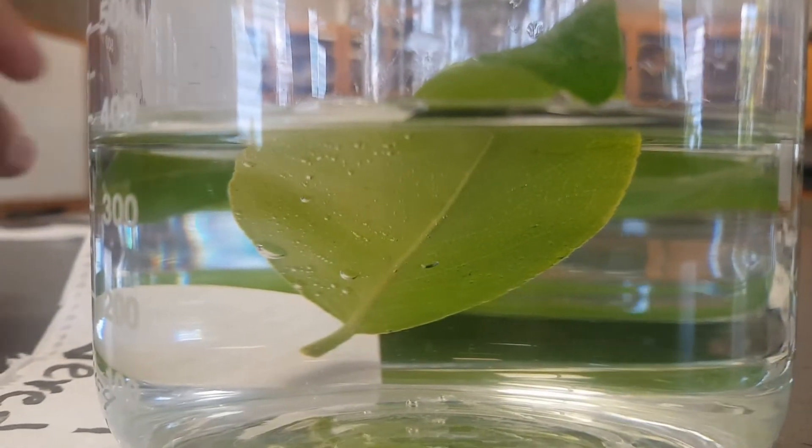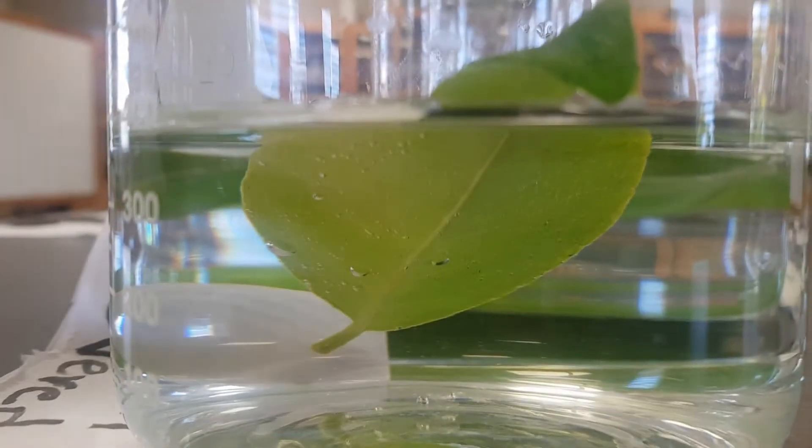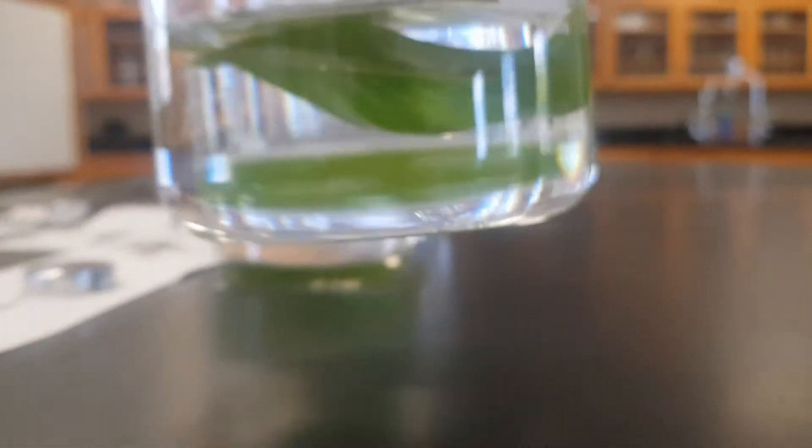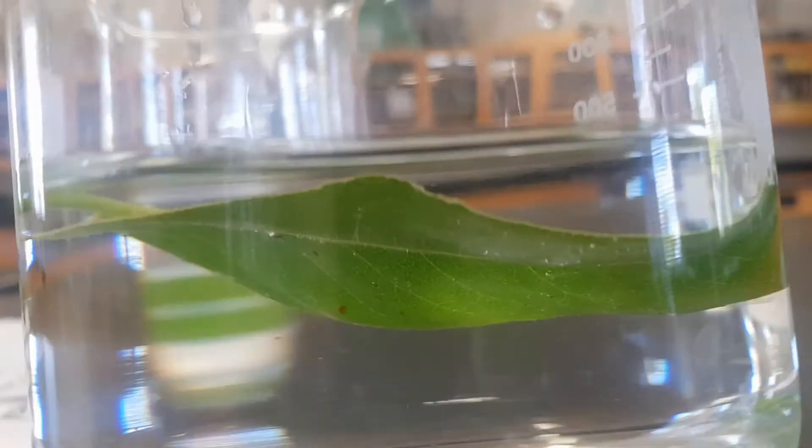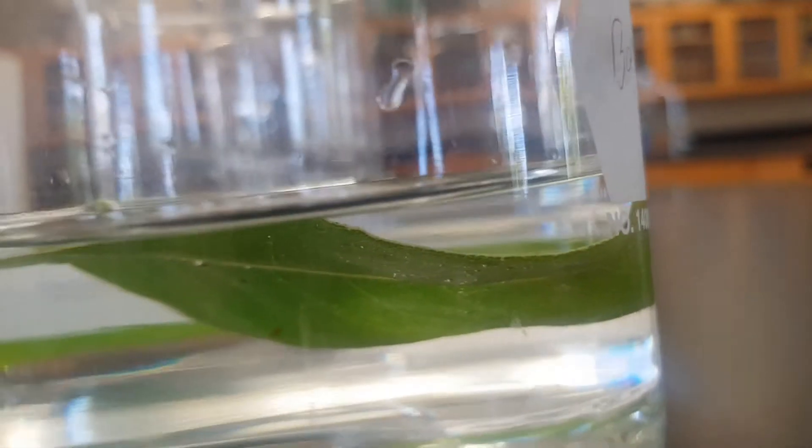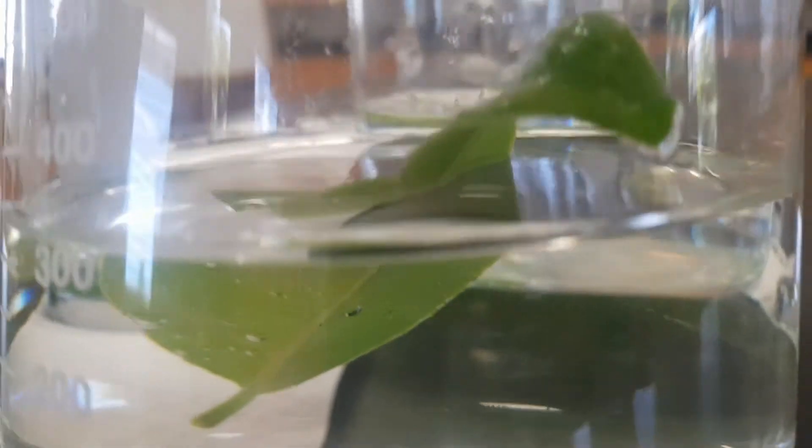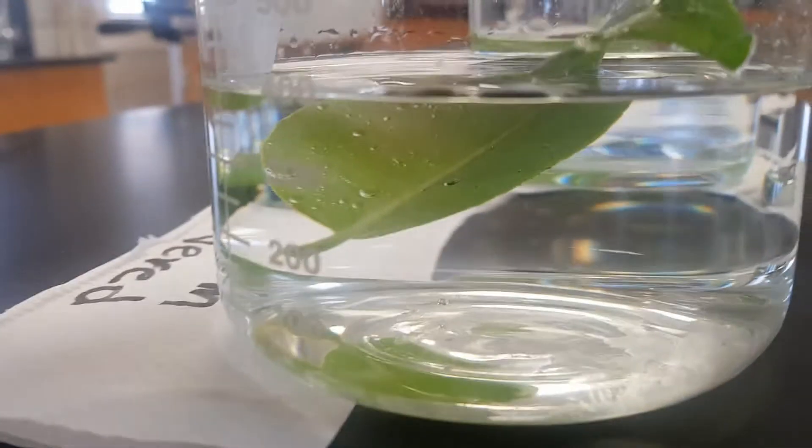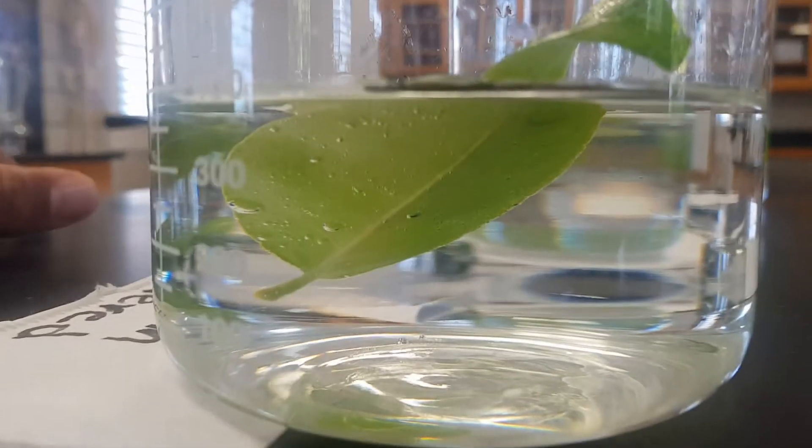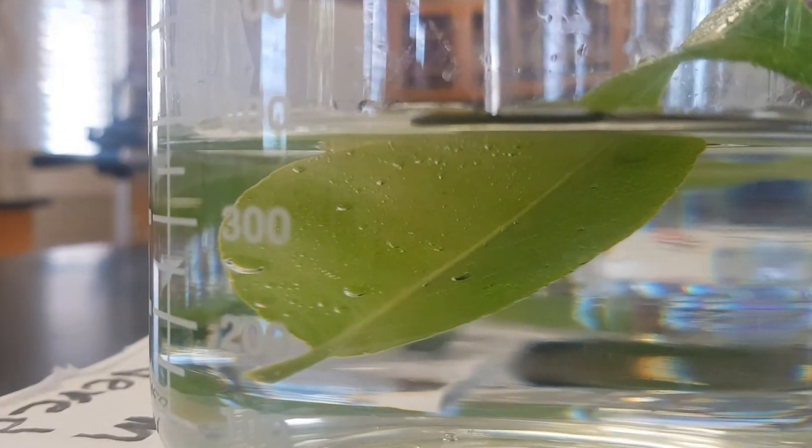If you notice under the leaf, you'll see a lot of bubbles under this beaker. Now this leaf, you'll see only a few bubbles there. That's the top of the leaf. Notice the bottom of the leaf compared to the top. This leaf, the bottom, has a greater amount of bubbles compared to the top of the leaf. Let's zoom into that. Notice you see the bubbles there. Awesome.